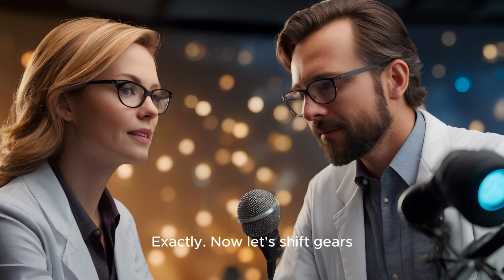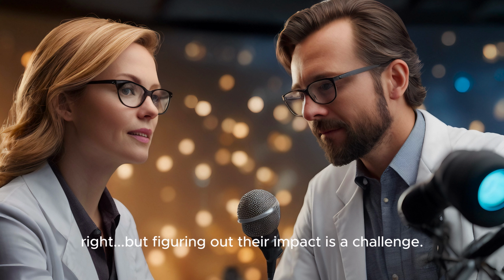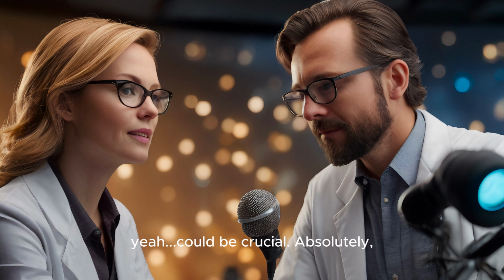Exactly. Now let's shift gears to microplastics. Okay. As we've discussed, these tiny plastic fragments are a growing environmental concern. Right. But figuring out their impact is a challenge. Different types of plastic, even different isomers of the same plastic, might break down in different ways. So being able to analyze the composition of microplastics at a very detailed level, even down to the isomer level, could be crucial.